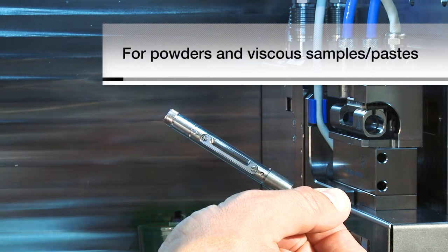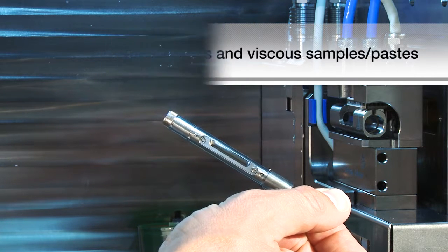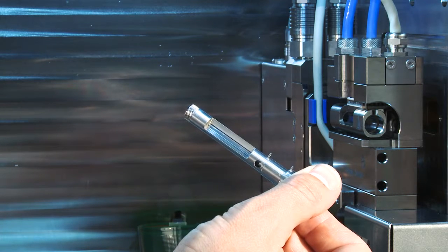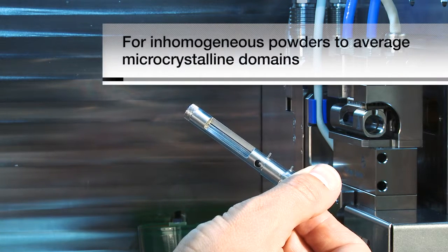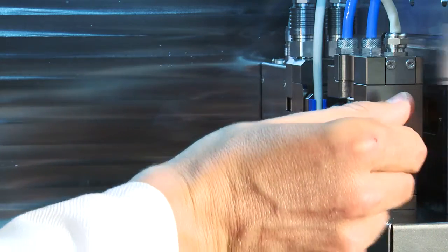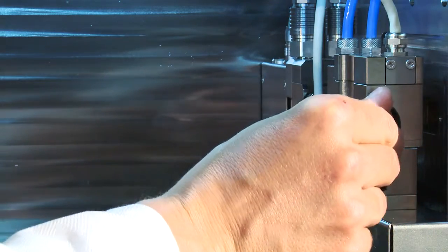The paste cell is used for powder samples and for paste-like or viscous samples. The rotor cell is used for powder samples, especially inhomogeneous ones which are rotated during the measurement.